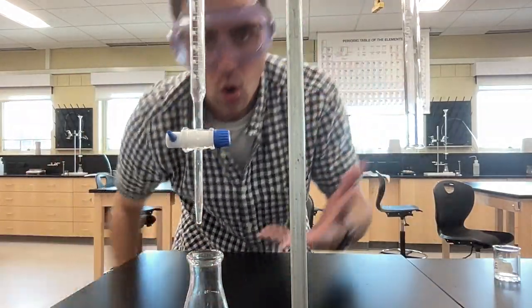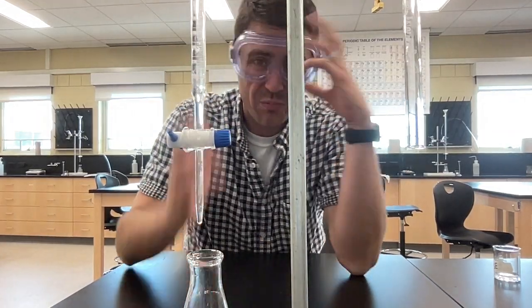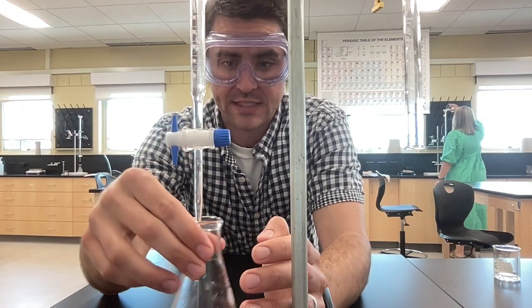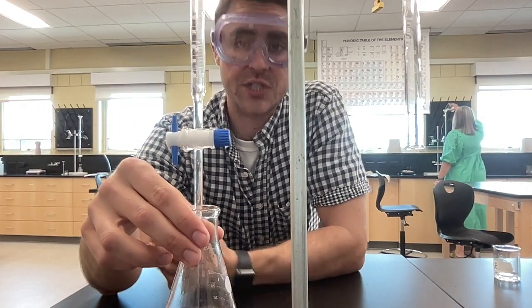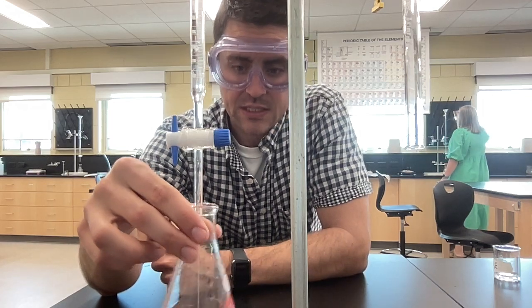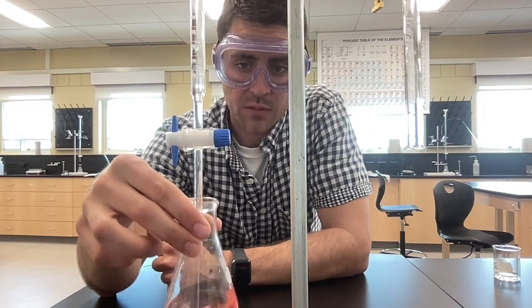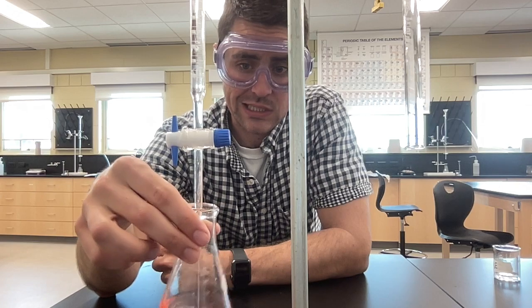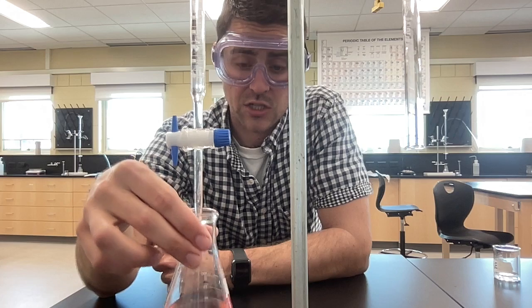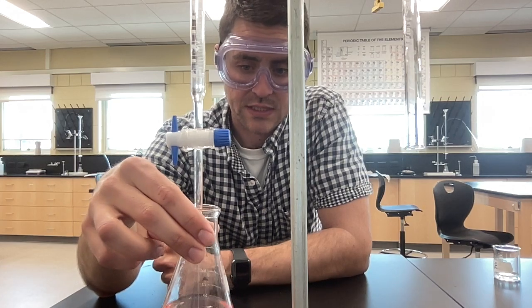Now I know, because I just did one, that if this is a stronger concentration of acid, I'm going to need more base to neutralize it. So I'm going to fire this thing up and we're going to roll this all the way past 10 milliliters, because we know it should take more than 10. In fact, 1 molar is exactly double 0.5 molar, so I should need something close to 20 milliliters of this base to neutralize it.